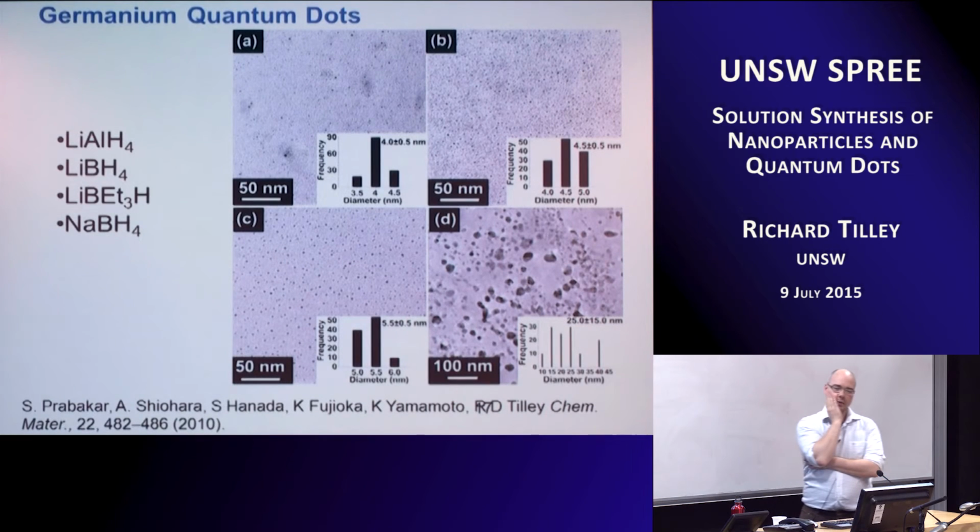So that's, I guess, where we're at with silicon dots. As I said, we tried to play around with them with different dopings. We've also done work with germanium as well. This is just an example with germanium, showing with some TEM that you can tune or control the size of the dots. And we've done the same with silicon as well.